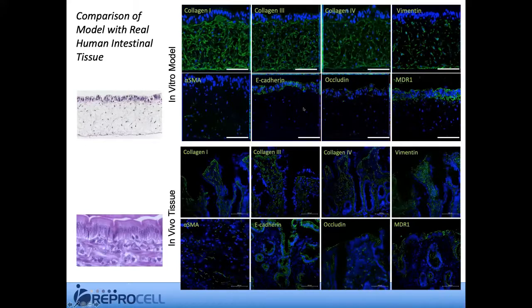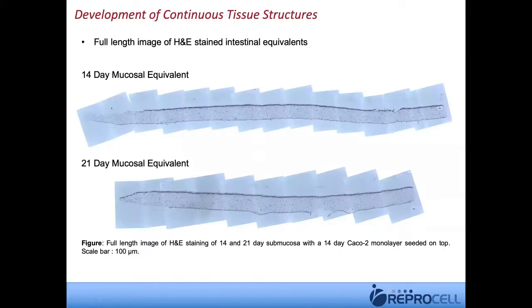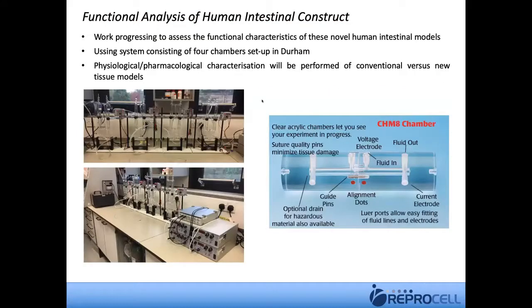We're also looking at various junctional complexes such as occludin in this example. So we can create membranes of this material as depicted in these slides here, several millimeters across. And we take those and we put them into Ussing chambers. So in this Ussing chamber, the central region here is where the membrane would be located.